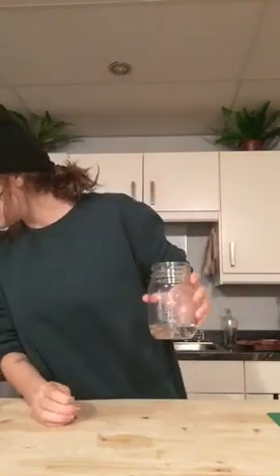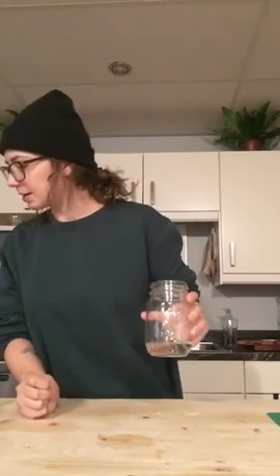So, okay, I've let the beef liver sit in the vinegar for 10 minutes, and I'm going to dump out the vinegar, and then I'm going to add hydrogen peroxide.